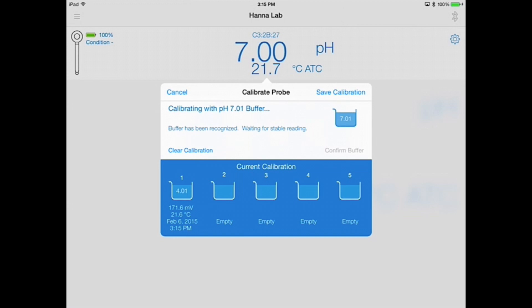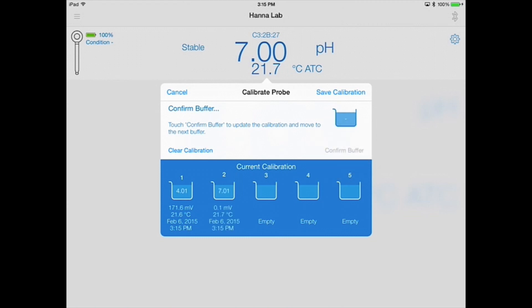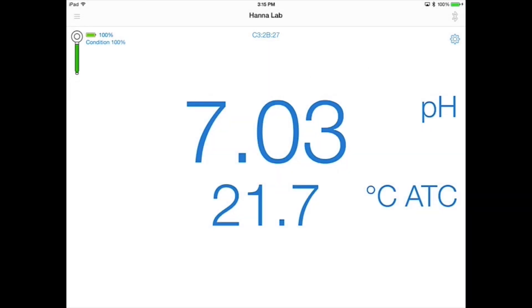With the HANA Lab app, you can calibrate up to 5 pH points. Once you've calibrated with your final buffer, save the calibration. Your probe condition and probe icon will then be displayed.